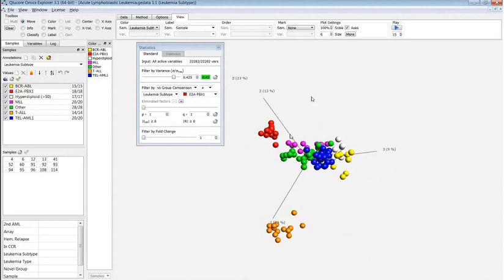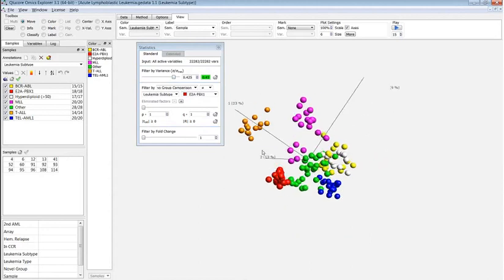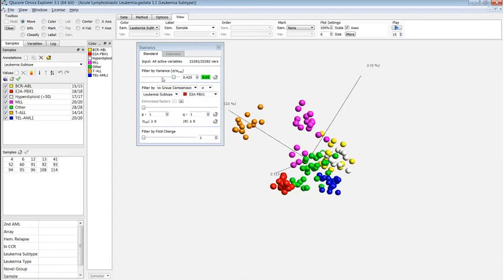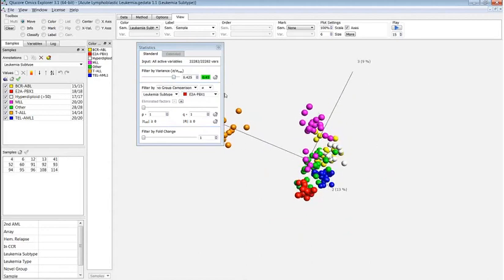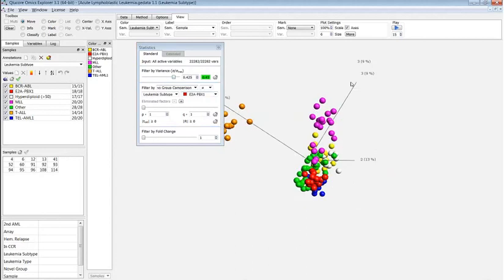So that was a real-world data set, and you can see the effect here. As I said, if you plotted the projection score as you drag the variance slider, it would be a fairly smooth curve with two maximums, and between them you filter out a lot of randomness in your data. You retain the informative structure.